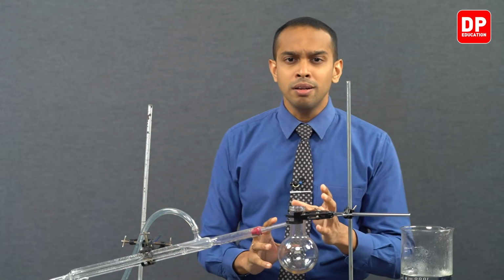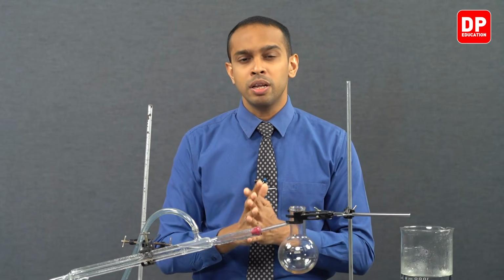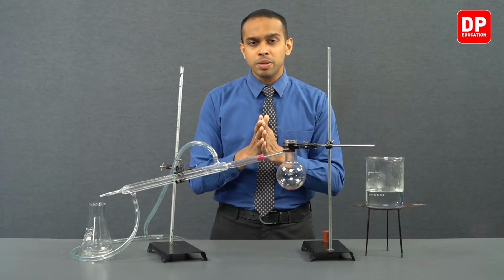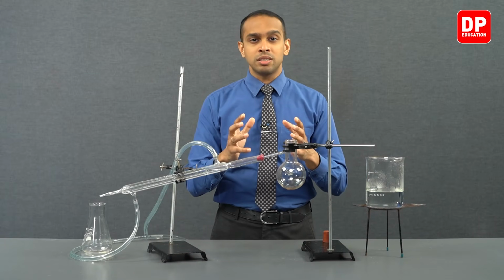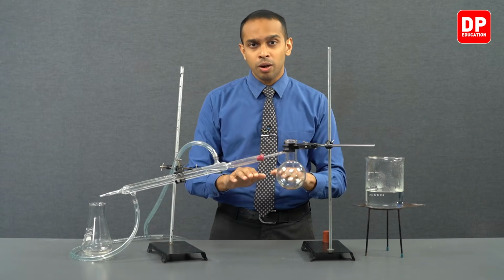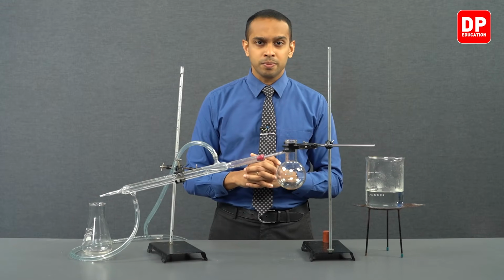The essential oil and water are not miscible. They are not soluble in one another. So when you have two immiscible liquids mixed together, we learned that the boiling point of the mixture will come down below each of their individual boiling points.